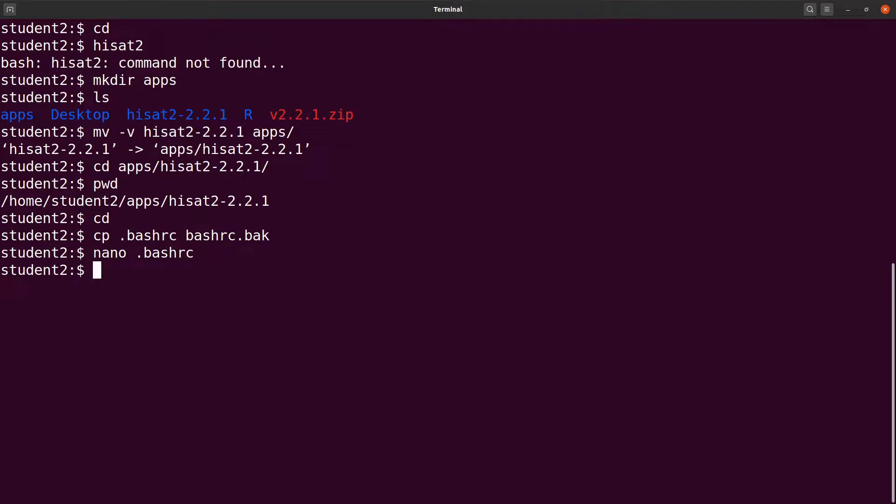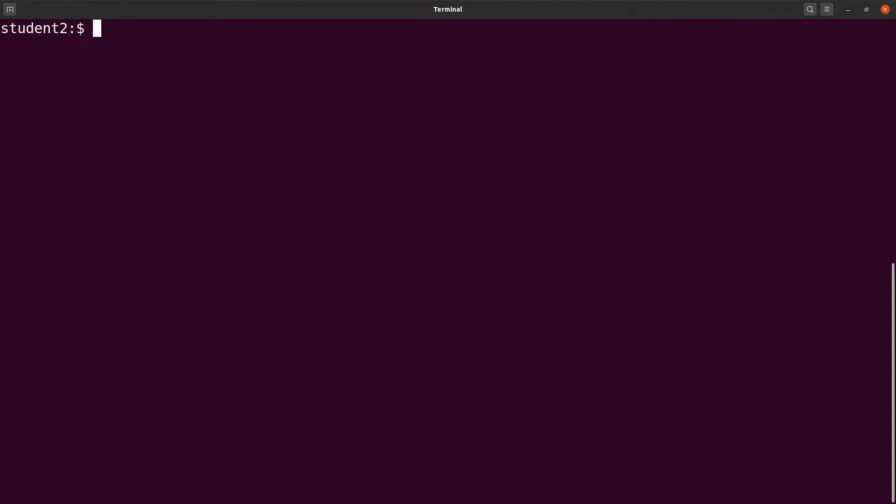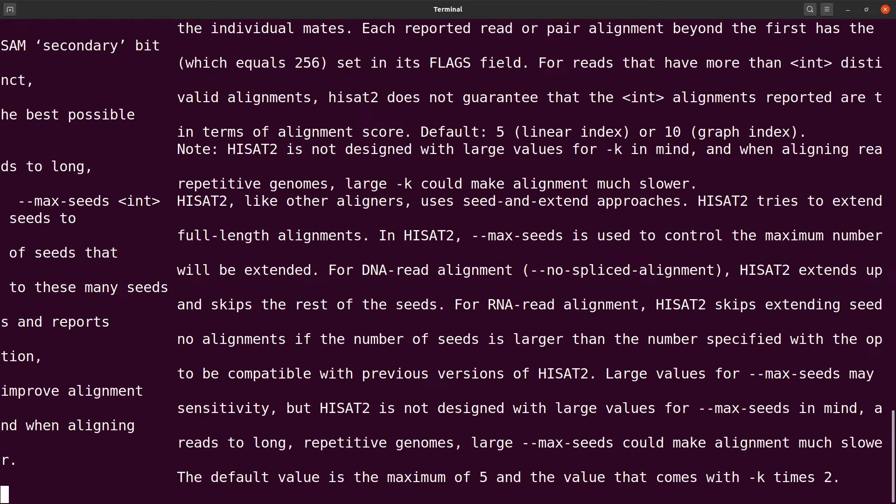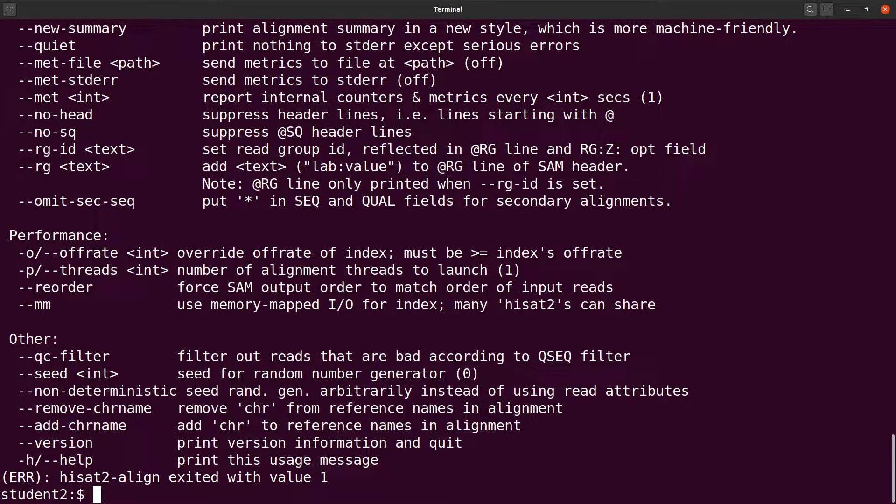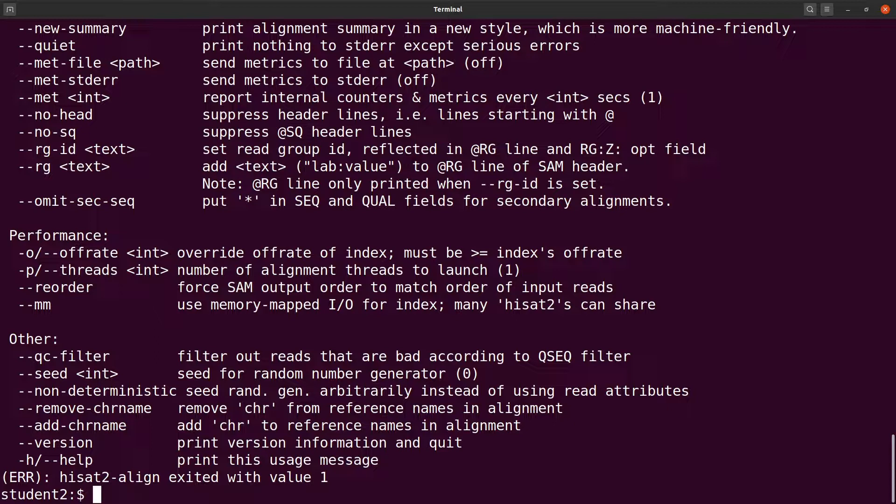Now what I'm going to do is to open a new terminal and then test HISAT2. I have my new terminal open. I'll just type HISAT2 and then I'll run it. Perfect. Now everything has been configured and it has been executed successfully. This is how we build from source to get HISAT2 installed on our Linux systems.